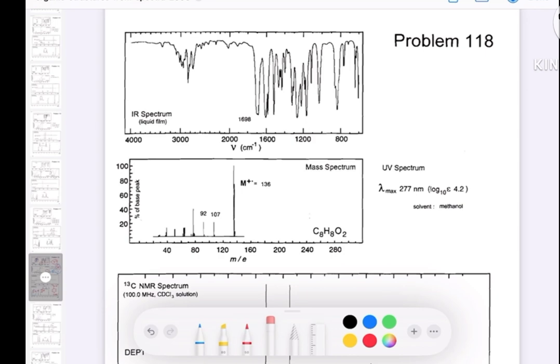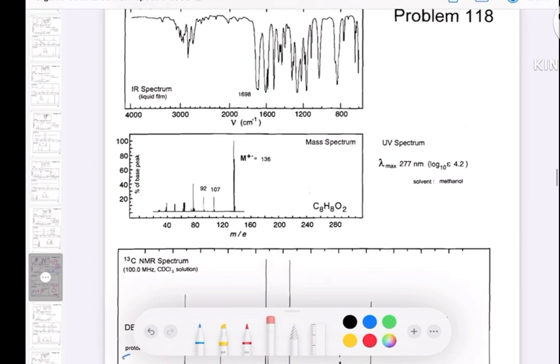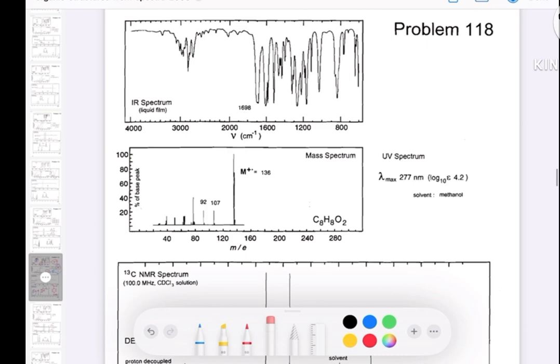Hello again. I'm going to solve another structure — this is a little bit more complex than the previous episode, so let's see how we are collecting the information from the spectra given.